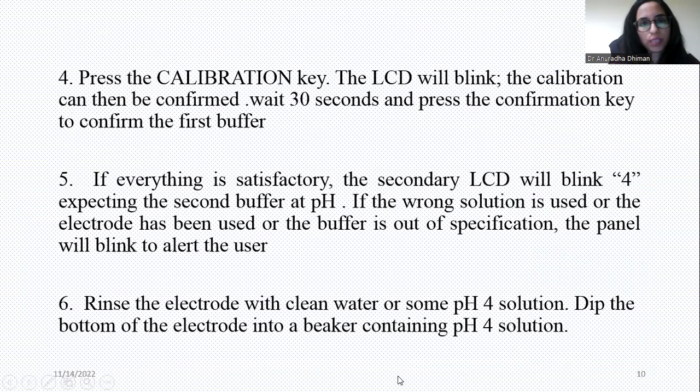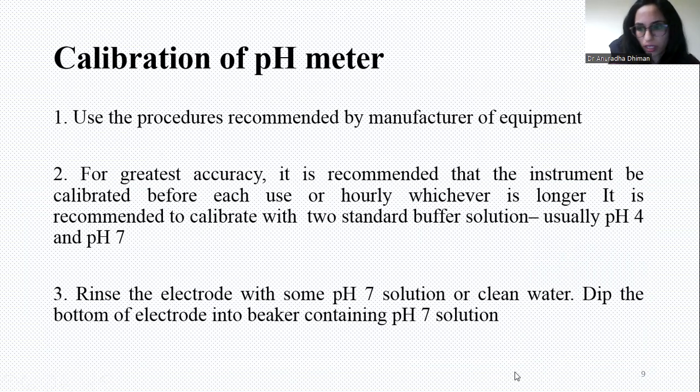Okay, pH meter. Now you know what a pH meter is. The procedure used is generally recommended by the manufacturer of the equipment. For example, if you are using a digital pH meter or any other type of pH meter, their SOPs are generally given by the manufacturer, but we need to design the SOPs according to our lab.